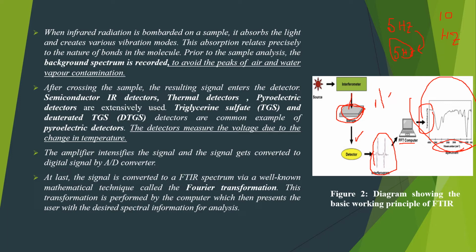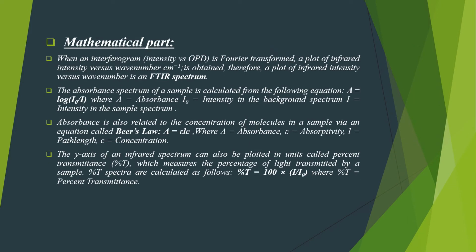Several kinds of detectors are there. Pyroelectric detectors are mostly used: triglycine sulfate and deuterated triglycine sulfate. So let me go to the mathematical part. The mathematical part says what I have told.